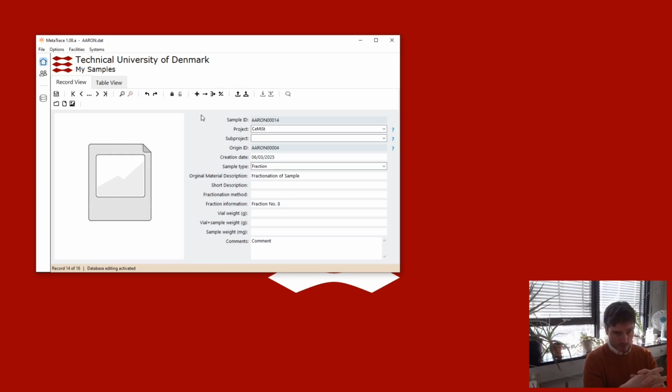So we have to maintain the unique IDs for these samples. So we maintain these connections between all our samples. We've only really looked at a very simple example of connecting these different records, but these chains between records can, in theory, be very, very huge.